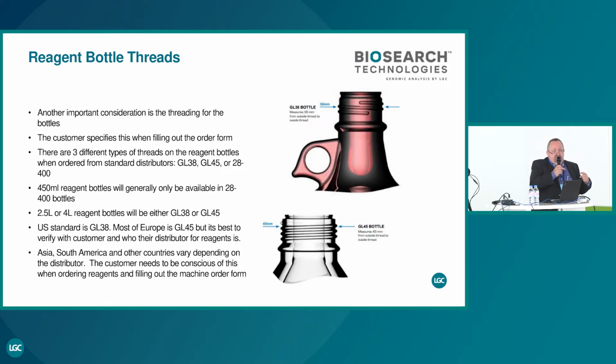And it's very important you discuss also with your reagent provider what they can provide you. Of course, they will be able to provide you the acetonitrile and all these things, but you have to check that they have the good bottle size and the good neck, because I saw in the past people order the reagent, but they were not able to obtain this reagent with the good bottleneck. That's very important. It looks so simple, but sometimes you can be completely blocked for, sorry about the word, stupid things.